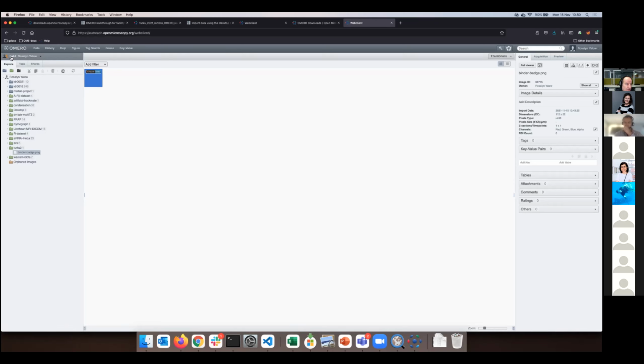How this is achieved again is up to Joanna. There is a feature in Omero which is called LDAP. This means that it can synchronize the usernames with the usernames in the institutional login store, so to say, login store.